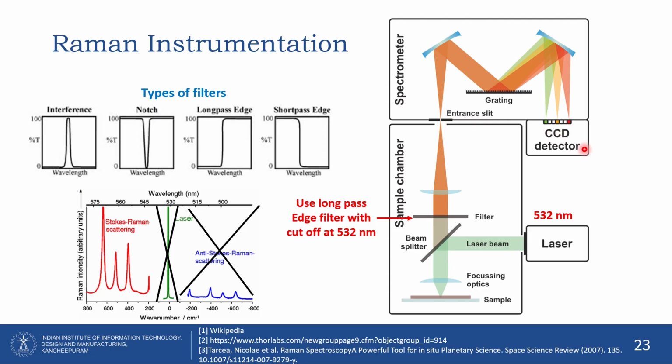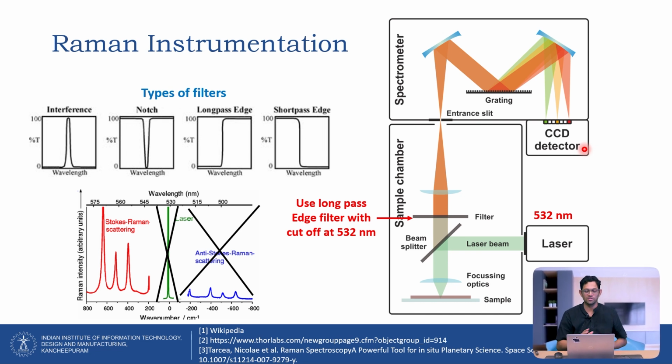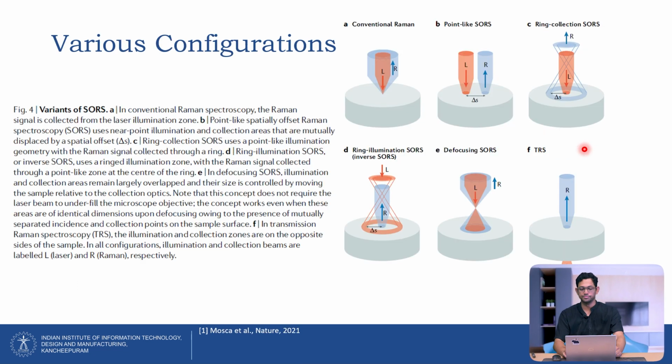Okay, for this spectrometer it requires only around 1000 linear elements, but if you're doing Raman spectroscopy, you need to specifically capture these peaks, so you need even more sensitive resolution. It could be at least 2000 to 3000 elements required in the detector to accurately detect the peaks, otherwise the peaks will not get detected.